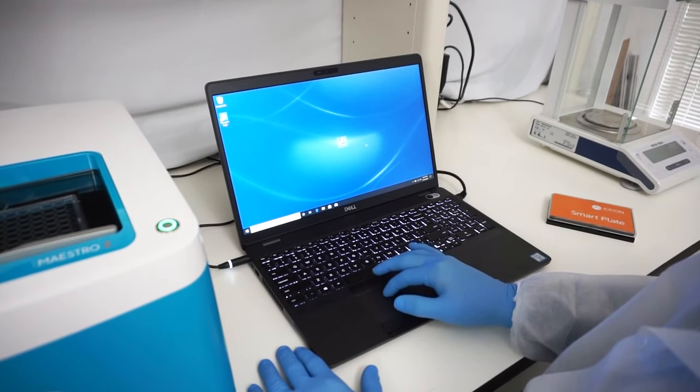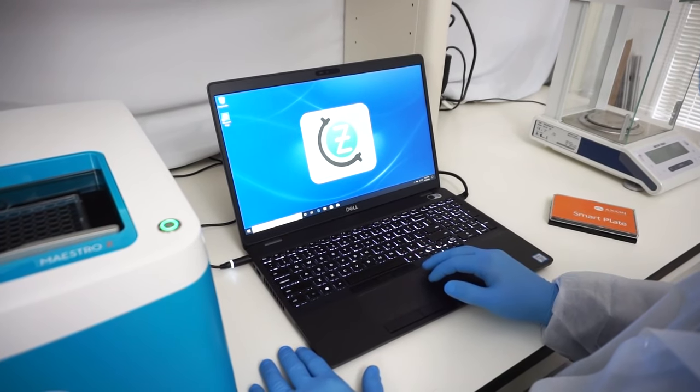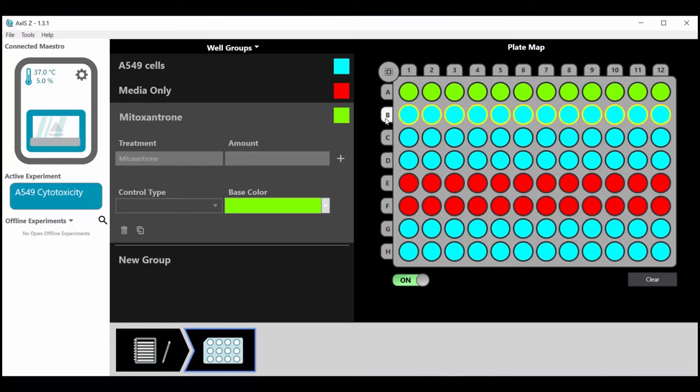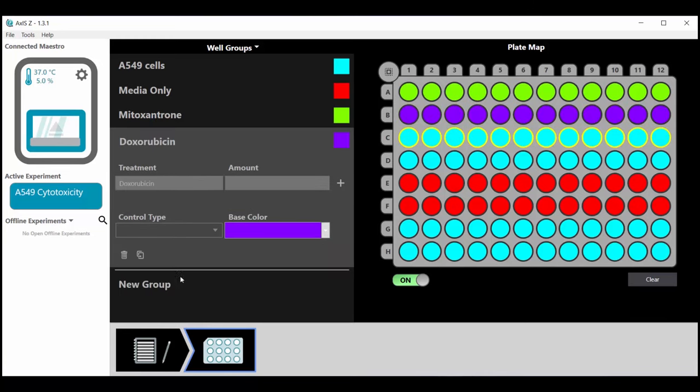AXIS-Z software makes experiment setup easy. Use the plate map editor to enter different treatment conditions and specify which wells belong to each treatment group.